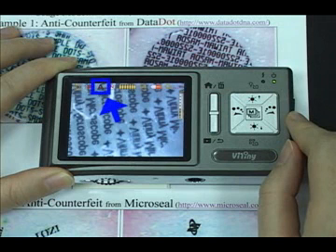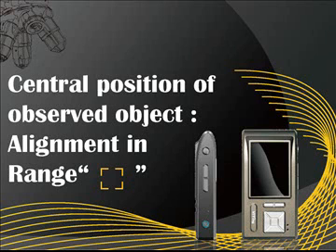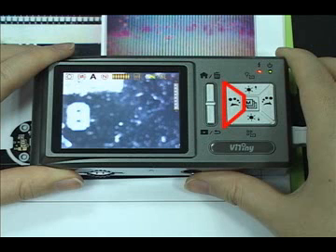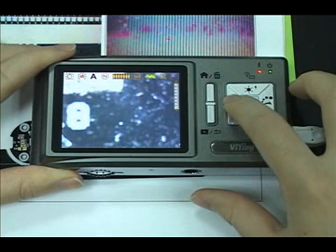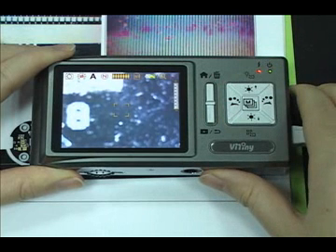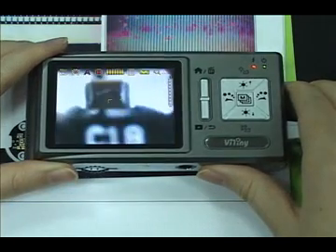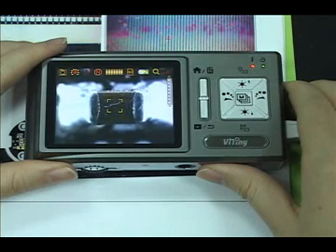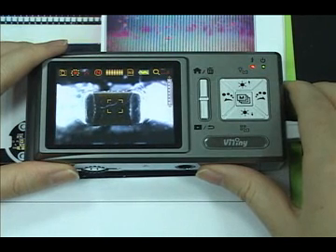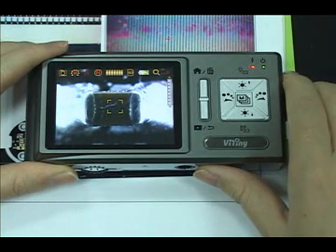The symbol on the upper left corner of the screen shows the current screen mode. Alignment and range: press and hold the left button to display the alignment and range sign. Use the sign to assist in enlarging the observed object. Press it again to hide the sign.